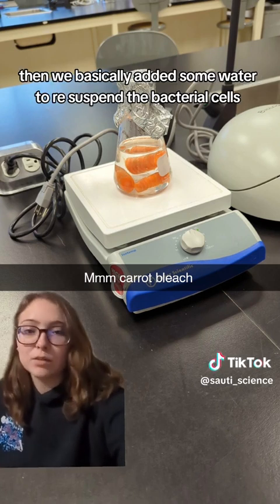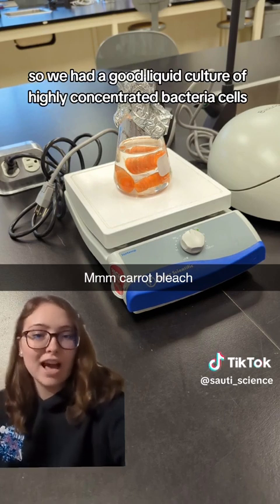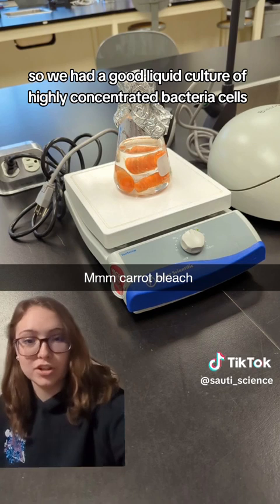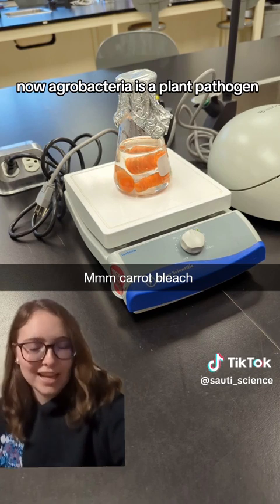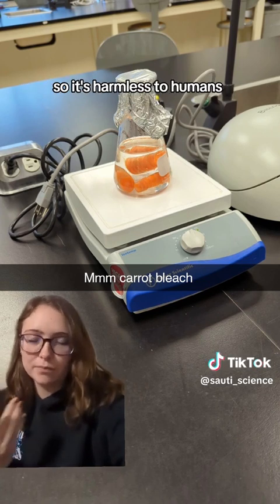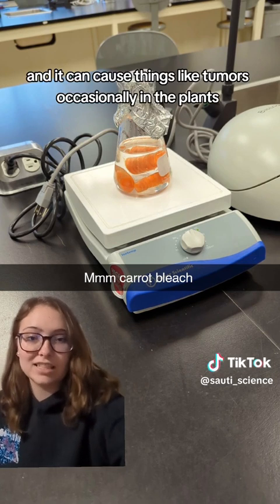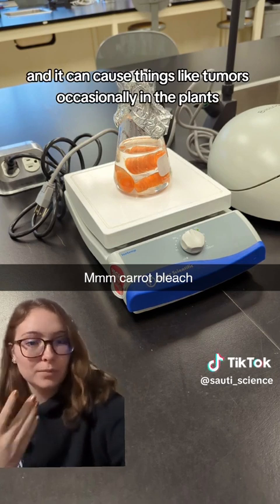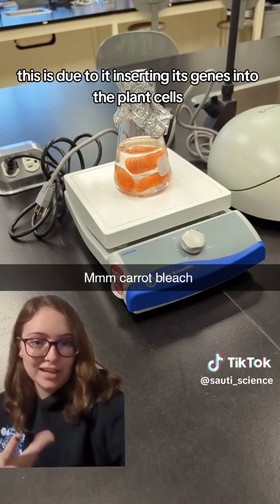Then we added some water to resuspend the bacterial cells so we had a good liquid culture of highly concentrated bacteria. Now, agrobacteria is a plant pathogen — it's harmless to humans, but it does infect plants and can cause things like tumors occasionally. This is due to it inserting its genes into the plant cells.